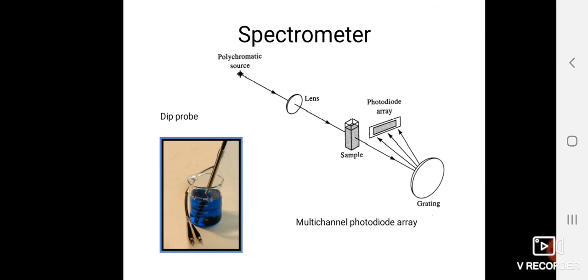This is again the spectrophotometer, and how it works is shown here with a very simple construction. In monochromators, people are also using gratings. Gratings are small-scale structures with a number of etched lines which can give light of a single particular wavelength.